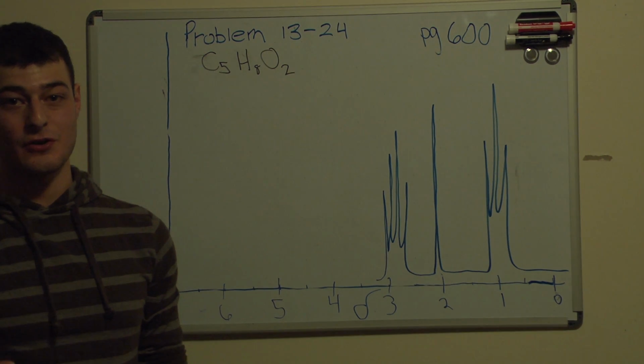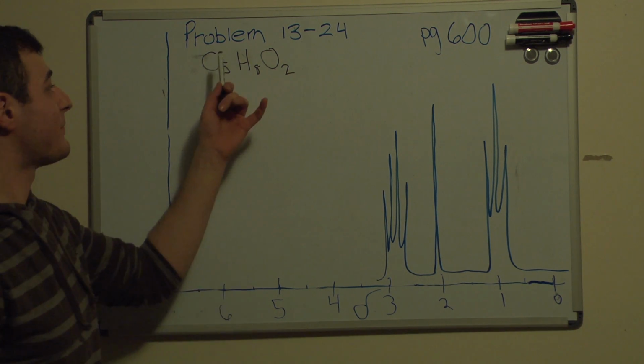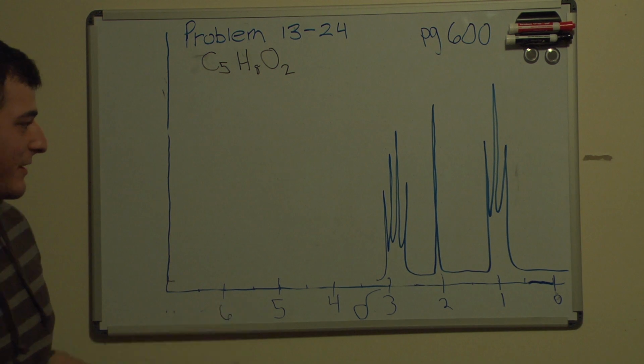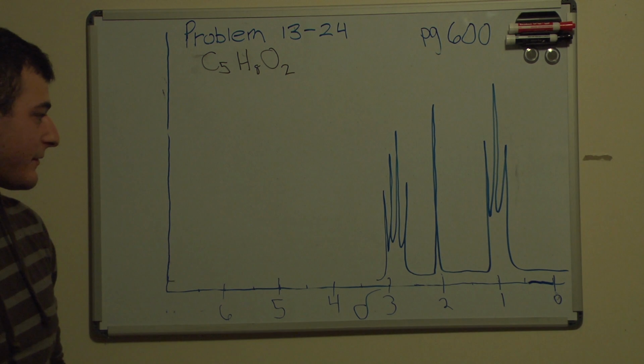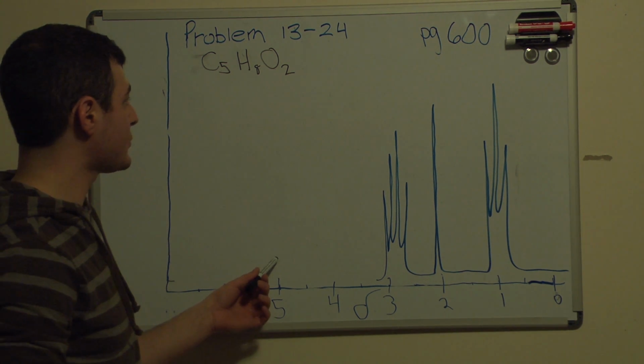Alright guys, so to solve our third problem, by the way this is problem C again, 1324, I changed the scale on my little NMR here, so keep an eye out for that just because all of our peaks are kind of upfield. So yeah, let me just start.